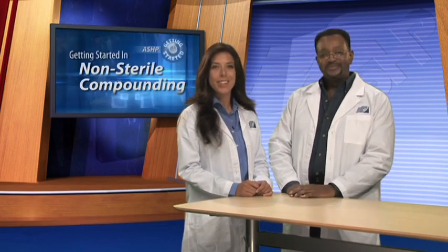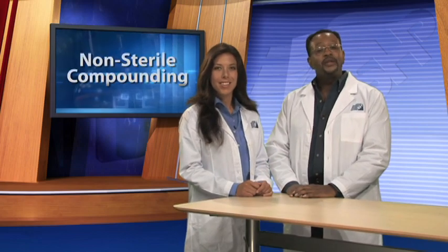In this program, we'll show you the most common forms of compounded preparations, explain the equipment most often used, and take a look at the fundamental techniques of this process. As you'll see, non-sterile compounding can be interesting and challenging and is an important part of your job. So let's get started. First of all, what is non-sterile compounding?